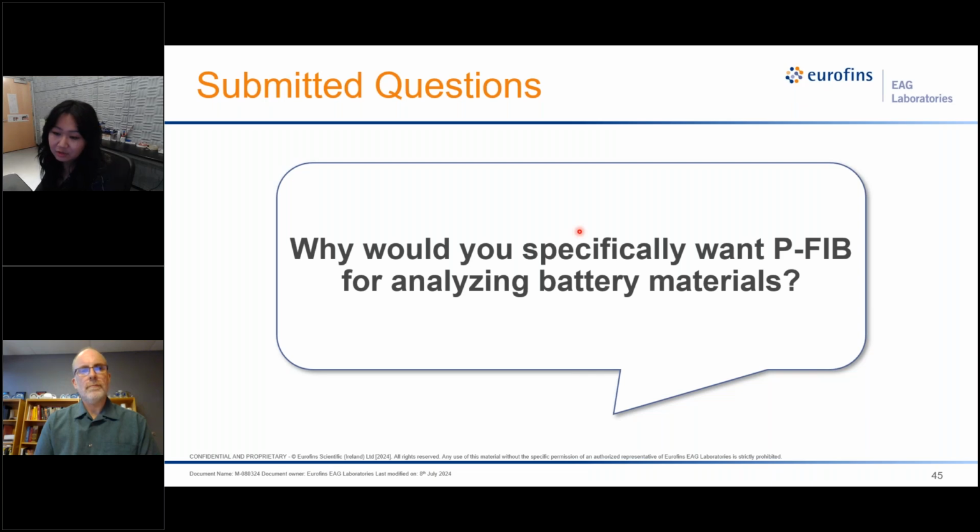Another question asks, why would you specifically want plasma FIB for analyzing battery materials?